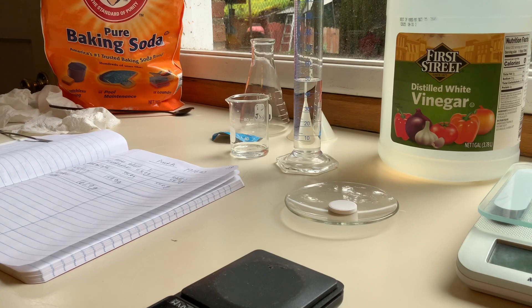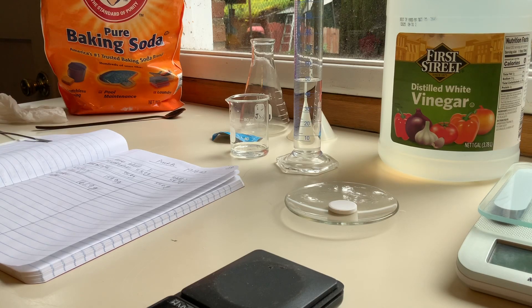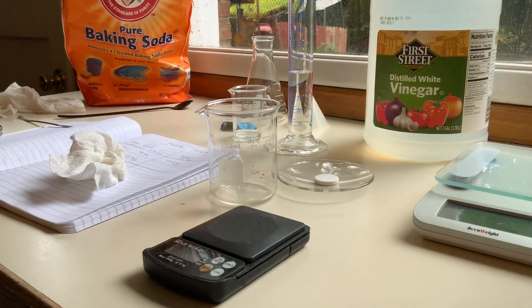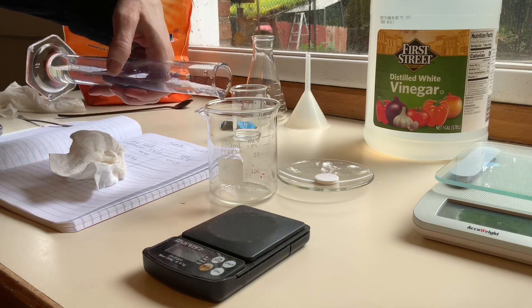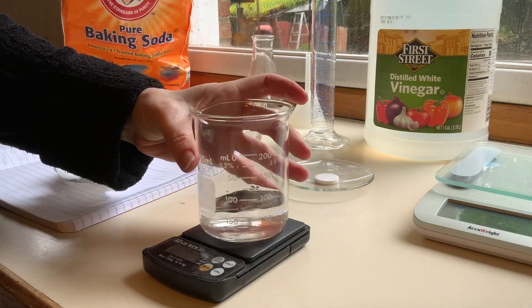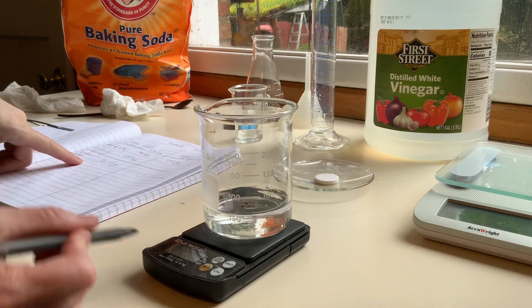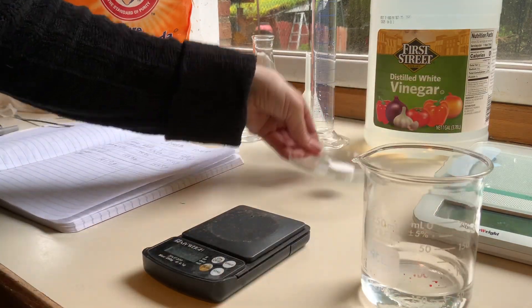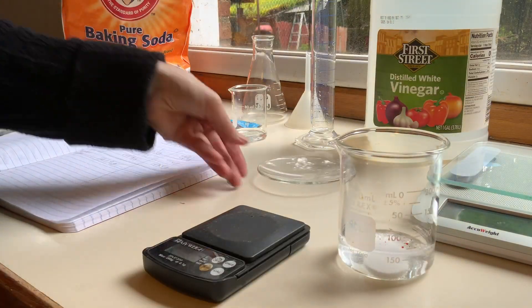Bear with me a moment while I wash the beaker out and give it a good dry. Then I'm going to add my acid to it. Now I'm going to weigh it — 159.5 grams, that's the beaker with acid before reaction. Now I'll drop that in and we just wait for it to react.